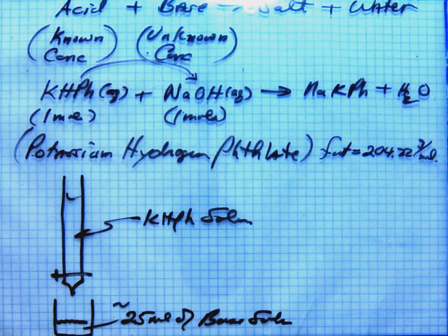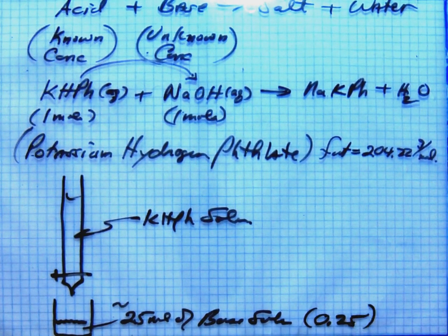In other words, what is our estimated concentration here, guys? What was the concentration we tried to make? Point what? Come on, guys. I ain't got time to play with you. 0.25. Somebody bark it out. 0.25. So what's half of 0.25? About 0.12, right? Why not just make it 0.1? Okay, see what I'm saying?